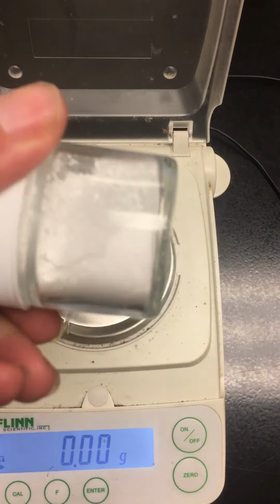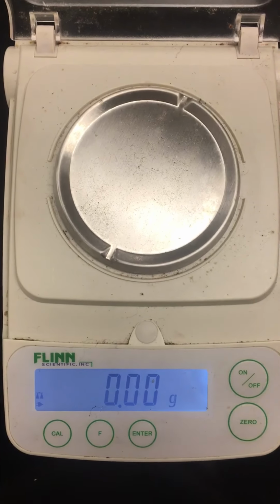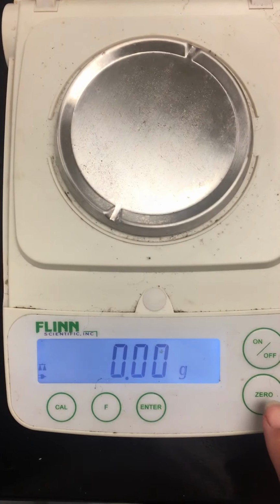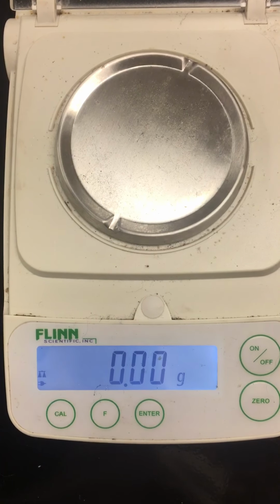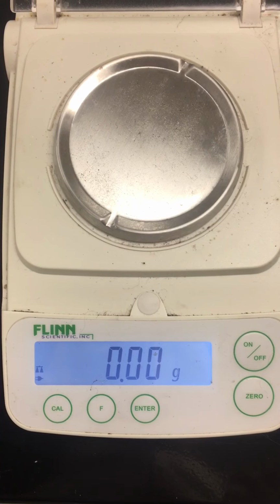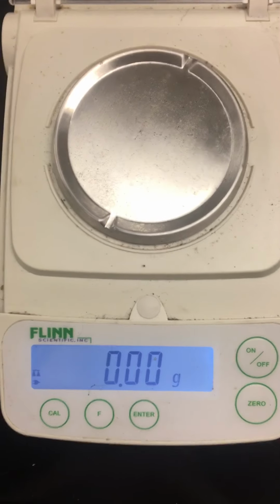There is a time, perhaps, when the scale might not go back to 0. So there's this 0 button, and you can just press it, and it'll re-zero the scale. Another name for that is called taring the scale, T-A-R-E.